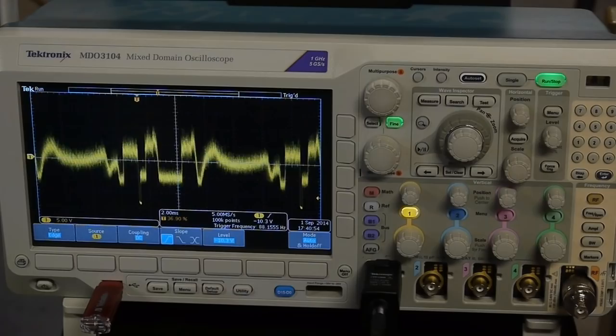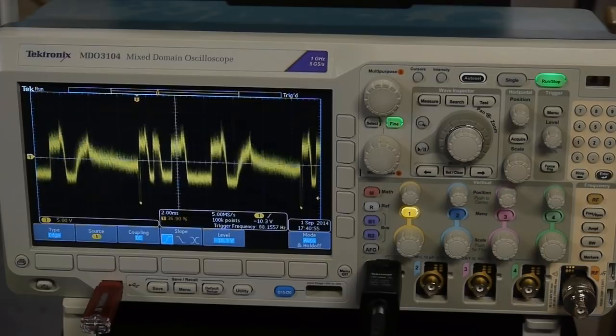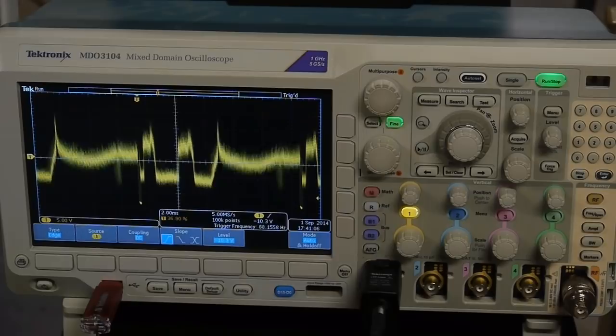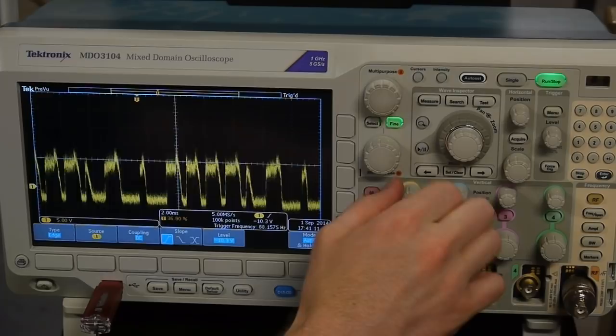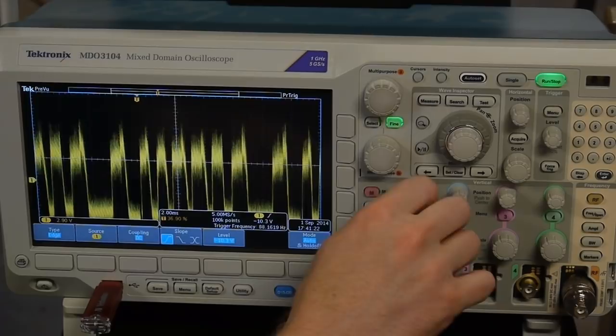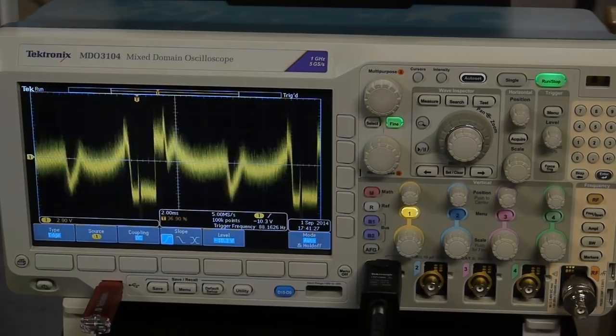So the first thing we want to do is maximize the dynamic range that we can capture with the oscilloscope. We're going to get eight bits of data that are going to span the bottom to the top of the screen. So since we're basically not capturing any signal from down here, what we can do is move the vertical position down, and then I'm going to fine tune the gain. So now our video signal is basically filling up the whole screen, and it's okay that the sync pulse goes negative.